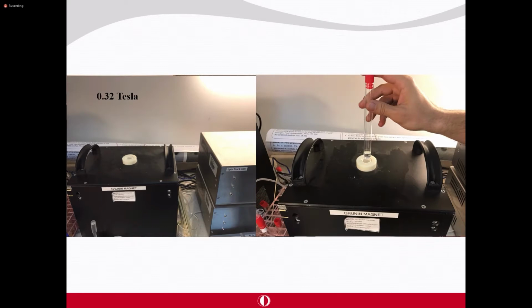millimeter, which lets us put, let's say, an olive directly into the tube, or we can put a hazelnut in the tube, and we can do analysis on these individual food samples without doing any extra preparation. So we don't need to add a solvent, we can just put in these particulate foods and do our analysis. Or whenever we work with confectionery products, we cut the confectionery, we can easily put it in the tube, and then we do the analysis.